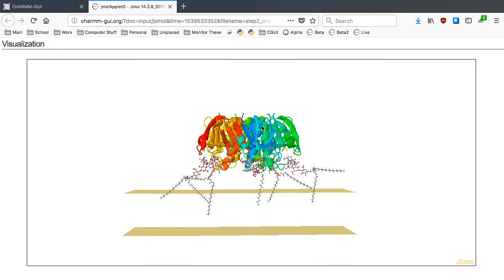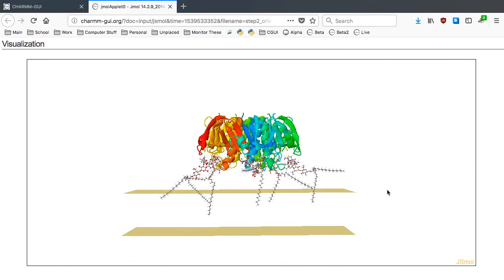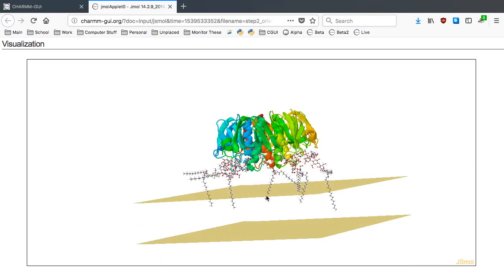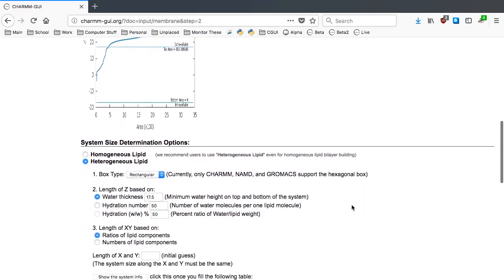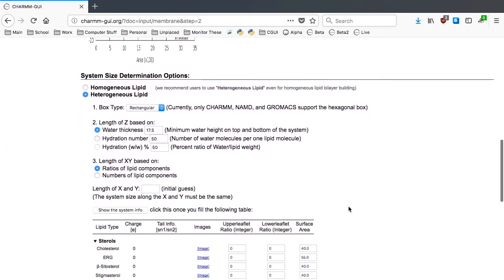Assuming that this orientation is acceptable, we can now start to build the bilayer. For the first two options, we can just take the default values.